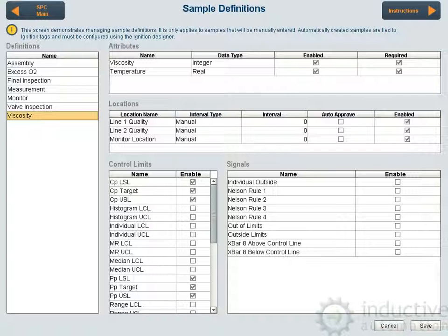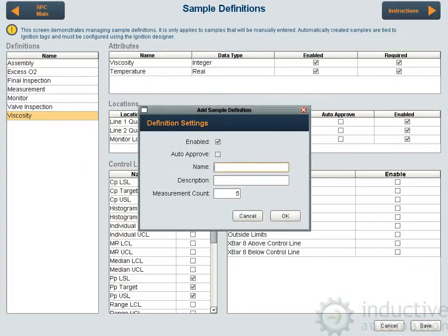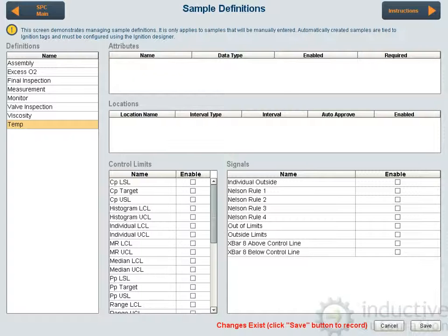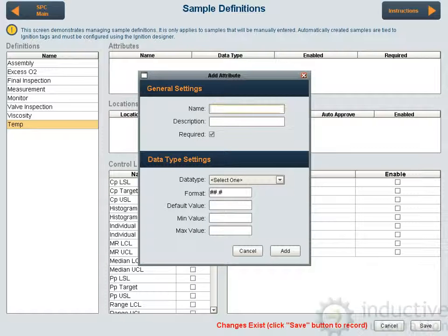This tells it what rules to evaluate and what control limits to evaluate. I can add a new definition — we'll just call it 'temp' for temperature — and we want to take two measurements for every sample, and then whether to auto approve it or not. We'll go ahead and select that, and there's temp, and then we can add here.